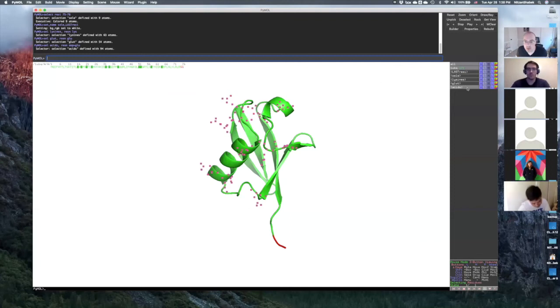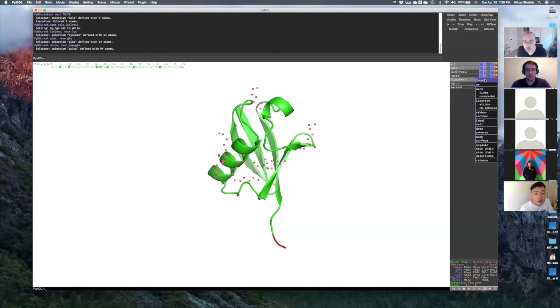So now what I want to do is just remove everything that's there. So basically unselect everything. I just want to focus on the lysine. So press on the lysine and just show the side chain. So how do we show the side chain? We go to show, and instead of choosing sticks, which will give us the whole backbone of the amino acid, we can just show the side chain in sticks, okay? Again, I'm going to show on the lysine, go to side chain, go to sticks.